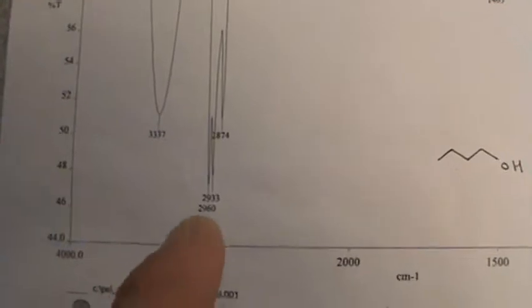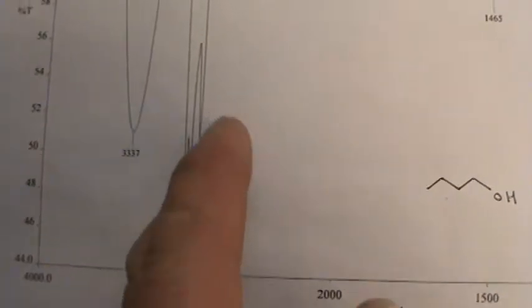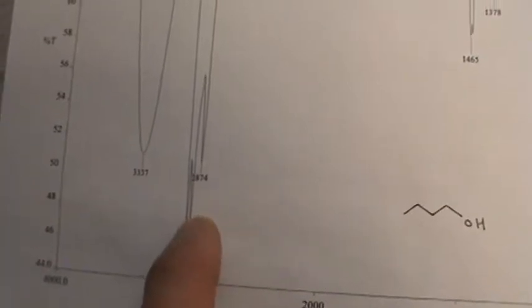So once you locate the two functional groups, you should go to Pavia and look up under alkanes how you can pick. They've got 3 or 4 reference spectra that you can see how they have picked their spectra. But in any event, for the carbon sp3 with a hydrogen on it stretching, yet again, that 3000 mark is very important. Anything just to the right, so you can see all of this right here, is obviously your alkane, your carbon sp3 with a hydrogen stretch.